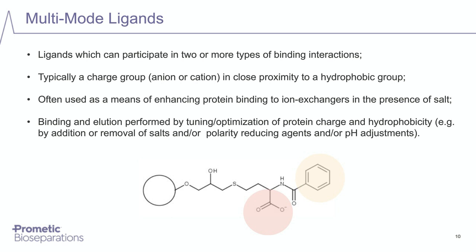And it's not uncommon with multi-mode ligands to have to spend a quite significant amount of time with a design of experiment type approach to fully optimize and identify the working window for binding and elution for these sorts of ligands. That is required because, generally speaking, there are relatively few multi-mode ligands available. The one shown here is actually the GE Capto MMC ligand that some of you might be familiar with. And certainly to apply that one ligand to the purification of any given protein is going to require fairly extensive optimization of the binding and elution conditions.